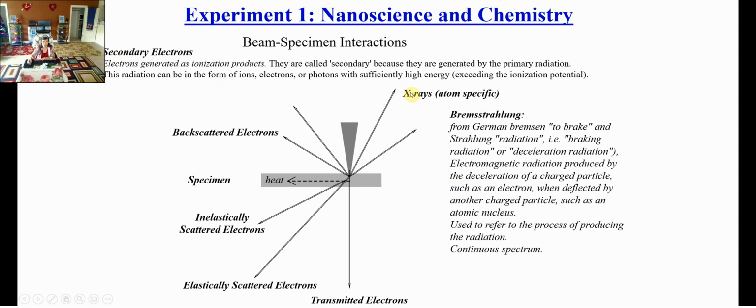And also those electrons have different wavelengths. Those wavelengths are located in the X-ray region, generally speaking, so you can collect energy dispersive X-ray. By this spectroscopy, you can analyze the different elemental compositions. Some of the electrons are going to be transmitted. We call these transmitted electrons. After being transmitted, they can be subject to scattering. One is inelastic scattering, resulting in energy loss of those electrons. Another group of scattered electrons are elastically scattered, so this one has no energy loss.